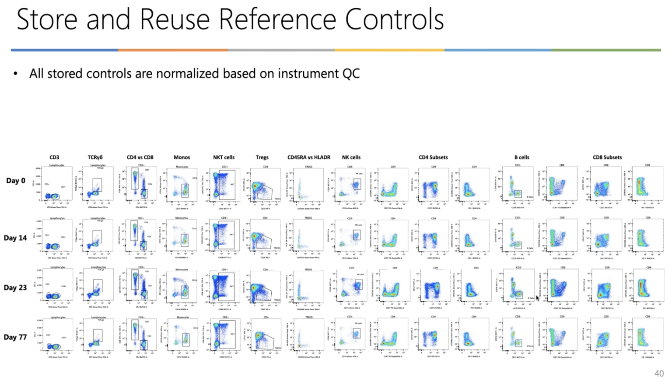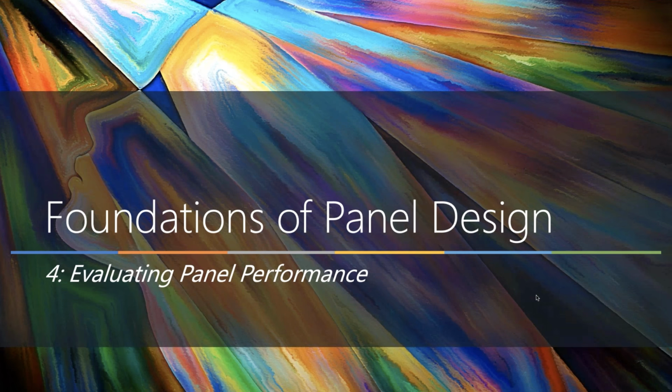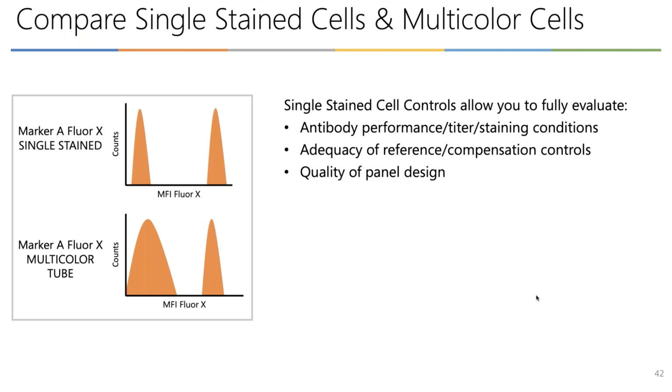So do I need to run controls every single day? We have ways in the software that allow you to avoid doing that and to reuse the controls. If you plan to do this, please talk to us. Let us guide you through the process. Let's make sure that we're saving the best possible controls in the software so we get the best possible results when you reuse them.